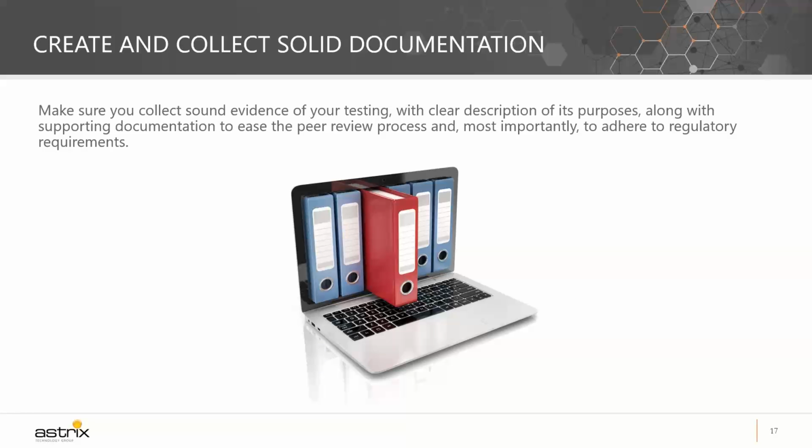About that, create and collect solid documentation. The best way to document customized calculation development is to separate development efforts into smaller sets of documents. Instead of doing one huge validation of all calculations within Empower, you break that into small sets of work so it becomes manageable. One of the best ways we've done this for other projects is separating it into test methods. For each test method in your laboratory, there is a small set of formulas and calculations that go with it. So you break that into small sections for test methods, and you do small cycles of validation. You create a protocol, validate for that test method, approve that, and you move forward, so it gets easier to manage.